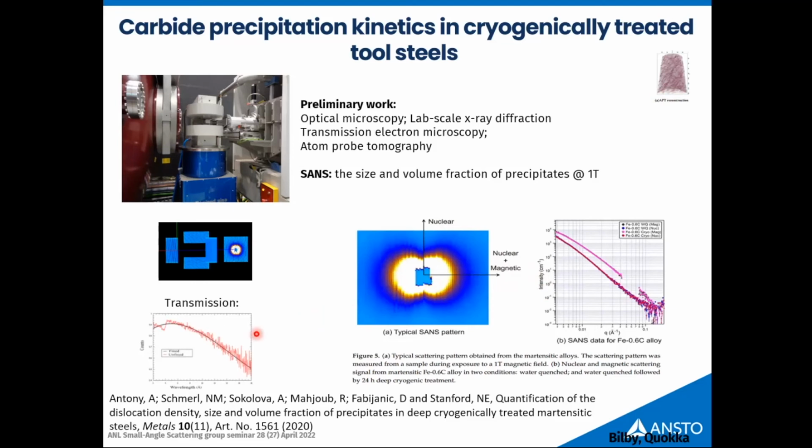And the thing which I really appreciate now in time of flight, those of you who work with metal will know quite well: it's an effect which is called the Bragg edge. So what it is, it's some wavelength, so this is transmission, right? This is our entire spectrum, transmission through the sample, and you can see some kind of step at some point. What is this? It means that for a semi-crystalline material like metal, you have some wavelength at which neutrons experience full back reflection. They're not going through, they're just reflected back from your sample, and this gives you that dip. So it's called the Bragg edge. And when you have time of flight, you're actually capable of looking at this transmission itself and getting some information about your material only from a transmission measurement. It's pretty nice.